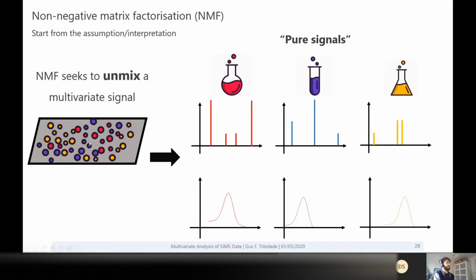So basically, what we try to achieve is to separate the contributions of these pure molecules that will be yielding specific peaks at specific ratios. So we get something that looks very much like the spectra of the original pure compounds. And we also get the concentration distribution of these things if you have several variables, because now you know the individual contributions, the individual pure signals, you can get the concentration of each for a specific sample.